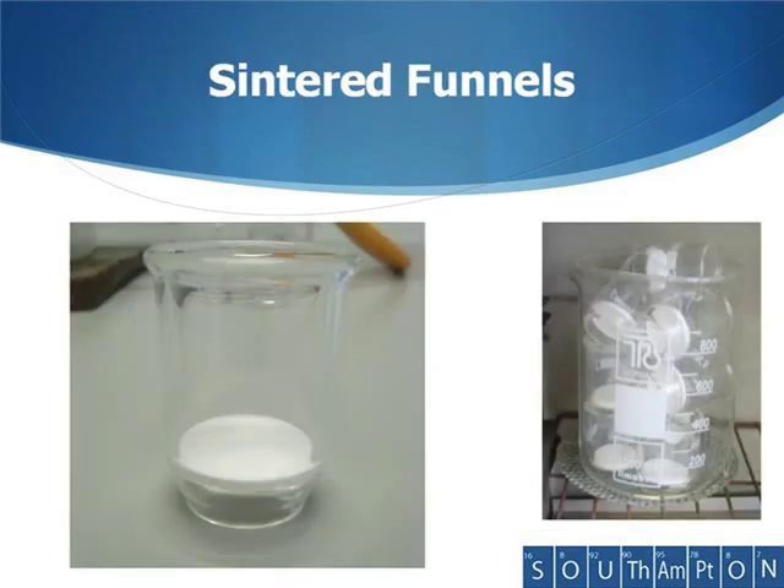Sometimes we use sintered funnels. These have a glass sinter at the bottom — that's the white thing you can see in this funnel. It has very small holes in it; it's porous. The porosity can be changed so you can get sinters of different grades, some of which have smaller holes than others. We tend to use these for very small quantities or where we have very finely divided powders.